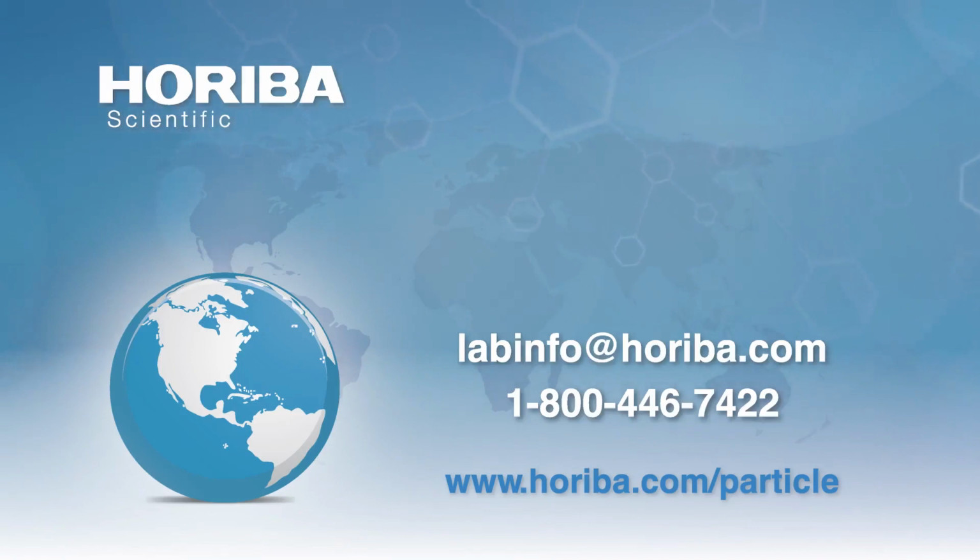Thank you. Next, how to define the pH of the storage buffer in relation to zeta potential? The pH of the storage buffer. Well, it depends on what the isoelectric point is. You can't store pure rutile titanium dioxide in water at pH 6. It's aggregated. So if you make it at pH 4 and it's stable there, then it should stay. In fact, I know it will stay stable. You can actually make it more stable by using a dispersing agent.